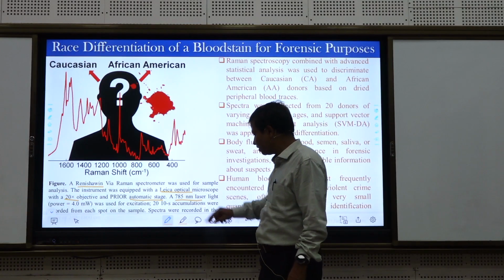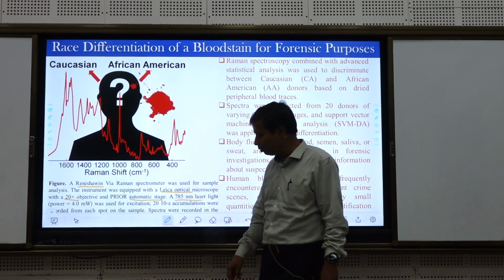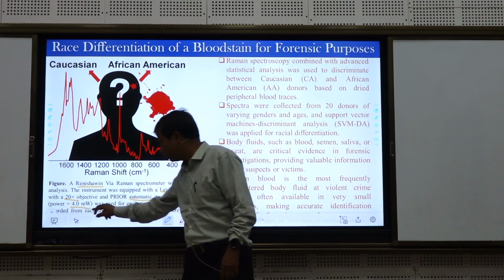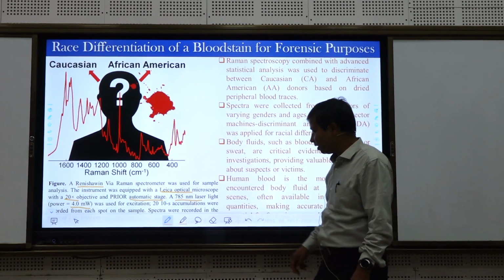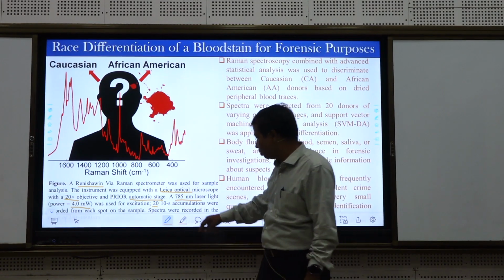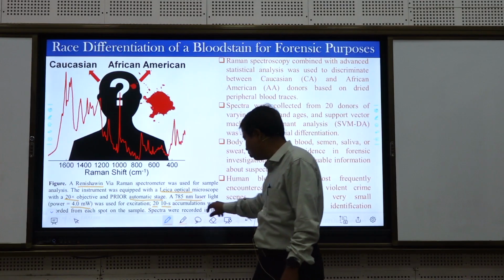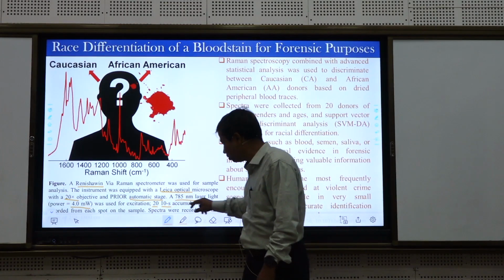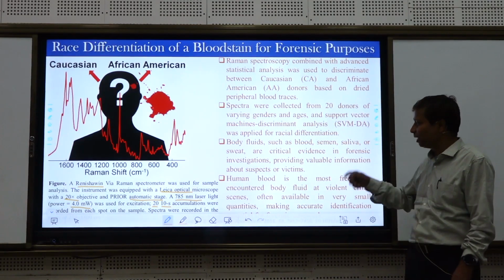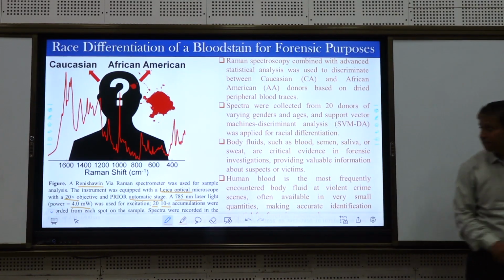The excitation radiation they have used is 785 nanometer laser light. Power is 4 milliwatt. 10-second accumulation times were used, and I think 20 samples, 20 times is recorded.